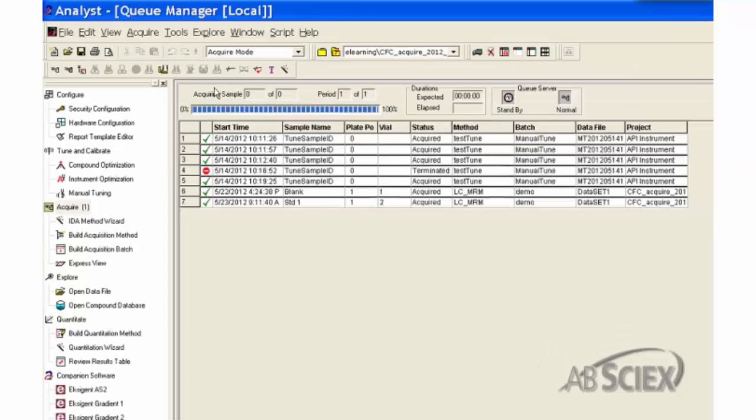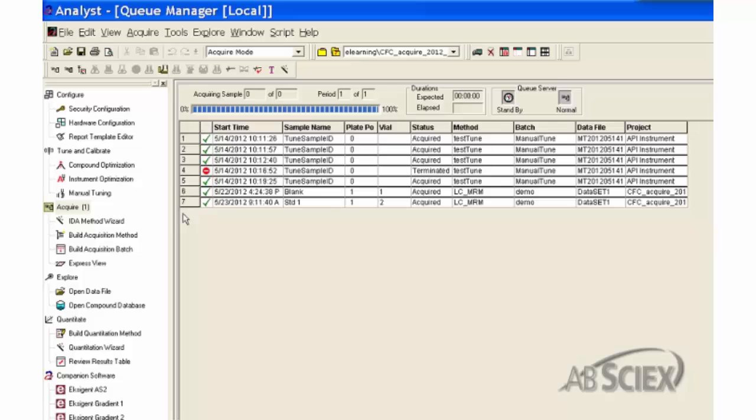In the Queue Manager window, you can find the instrument and sample status, as well as the sample submission list. Detailed sample submission and analysis information can be observed here, including start time, sample name, plate and vial number, status, method and batch used, data file, and project folder.